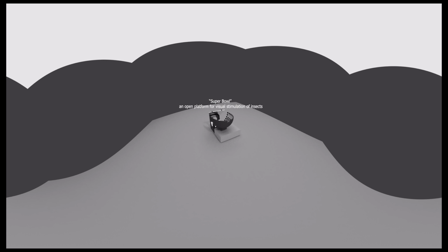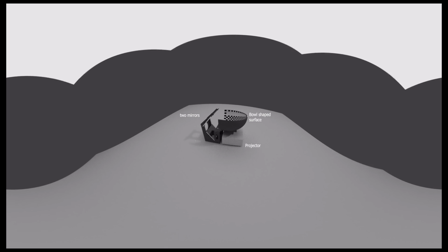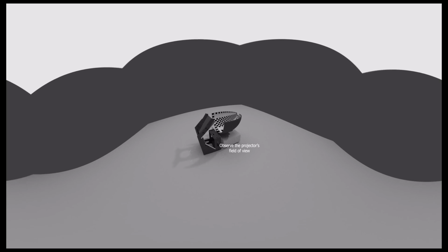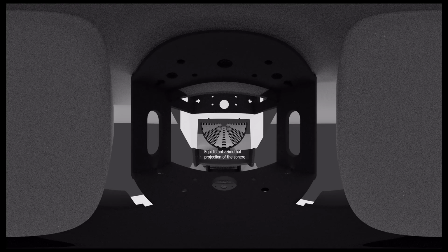Hello, in this video I want to introduce the Super Bowl visual stimulation system. It consists of a light-generating projector, two mirrors, and an adaptively designed bowl-shaped screen. The geometry allows the direct projection of a spherical texture without perspective distortions.